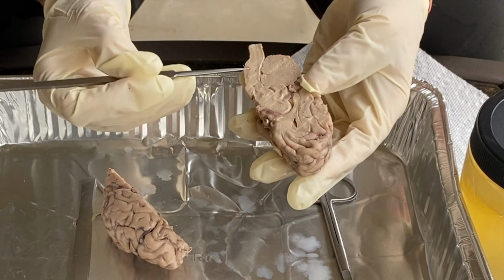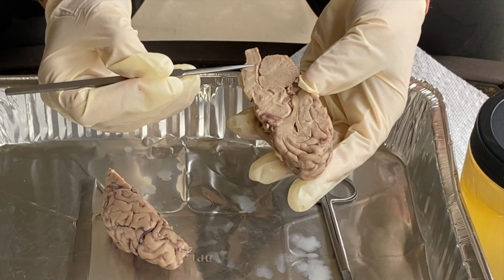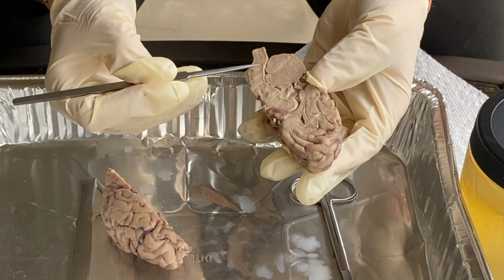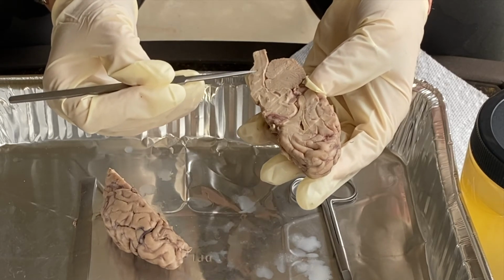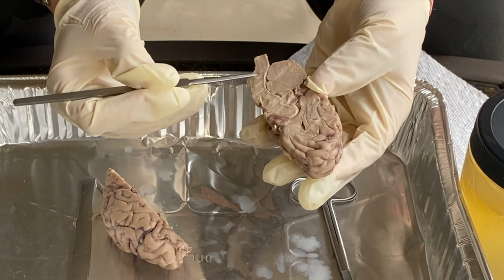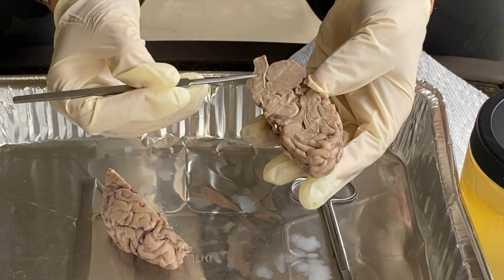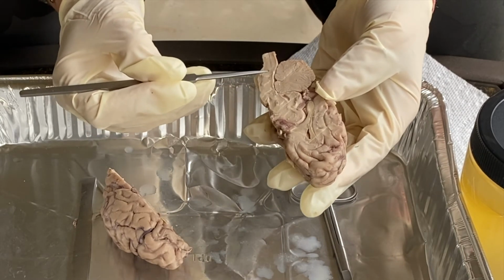Then we have the medulla back here that is responsible for regulating some of the most basic functions of life. So for example, your autonomic nervous system, which includes respiration, cardiac function, vasodilation, and reflexes like vomiting, coughing, sneezing, and swallowing that are essential to life and survival, are regulated.